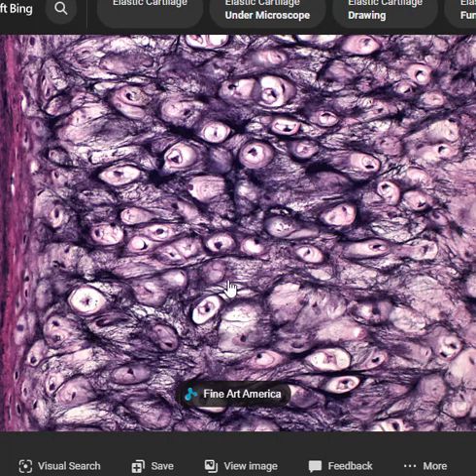I kind of like this picture of elastic cartilage because you can easily see the fibers. Do you see the individual fibers there? And you notice that they're not straight. So a lot of times when you see collagen, you see these big ropey straight fibers, unless you're looking at dense irregular. But this one I like because you can see that and you can easily see the lacuna in this particular picture. Right there.